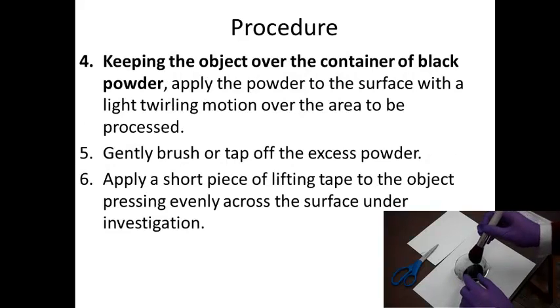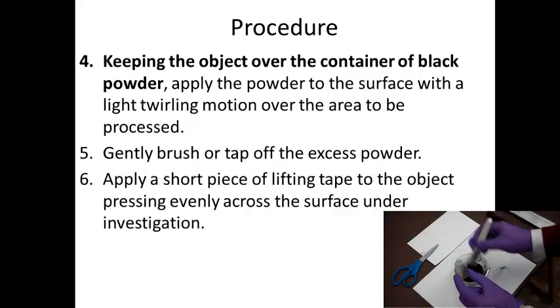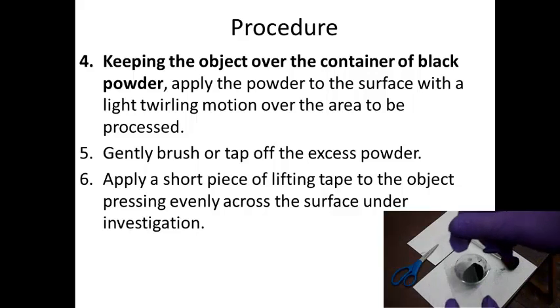Keeping the object over the container of black powder, apply the powder to the surface with a light twirling motion over the area to be processed. Then you can gently brush off or tap off any of the excess powder. None of this should really be getting all over the lab table — it just becomes a big mess. And if it does, please clean it up quickly.